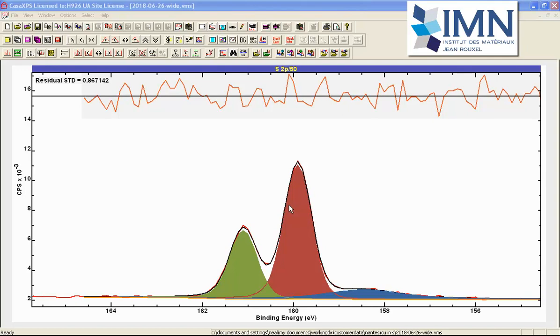Somewhere between input and output would be the full width half maximum. The reason there is a difference between the full width half maximum and the peak position and area is that the resolution of the instrument when measuring these data will have an influence on the line shape and on the full width half maximum. The instrument clearly has an influence on the shapes we see. If we reduce the pass energy, we get better energy resolution and a sharper peak; if we increase the pass energy, we get a wider peak. So the full width half maximum is determined by the acquisition conditions.